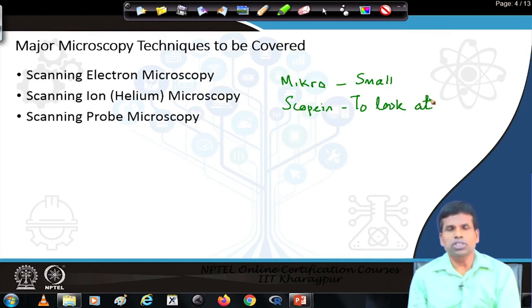We can also use ions. Ions and electrons are not the same, ions can be different. And ions can penetrate less into a specimen as compared to the electron, because electron is much smaller in mass, smaller in size, that can penetrate much deeper into the sample as compared to the ions. So, the ions can provide us much superior quality images as compared to the electron microscopy. So, that is where ion microscopy comes into the picture.